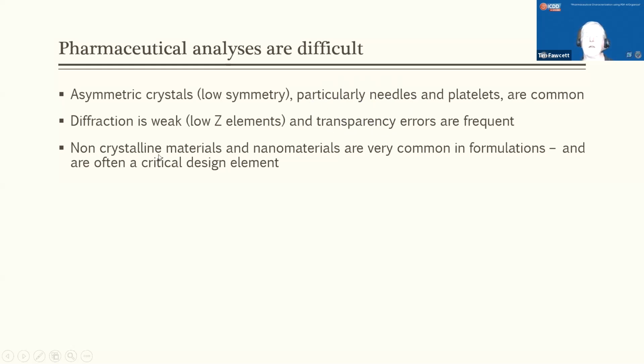The third thing that you've got to look out for is non-crystalline materials and nanomaterials. And these are part of the product design. And they're part of the product design because these materials have high surface area and they're involved in fast dissolution and controlled drug release.